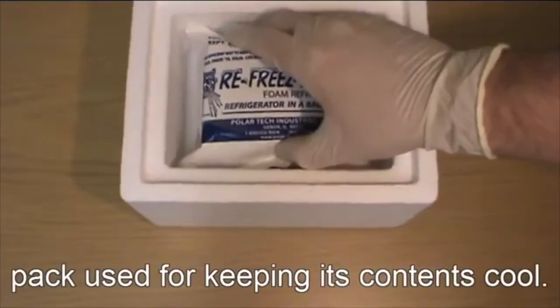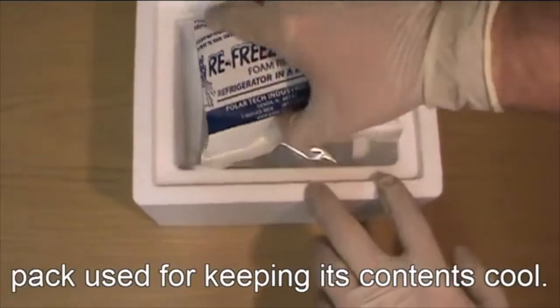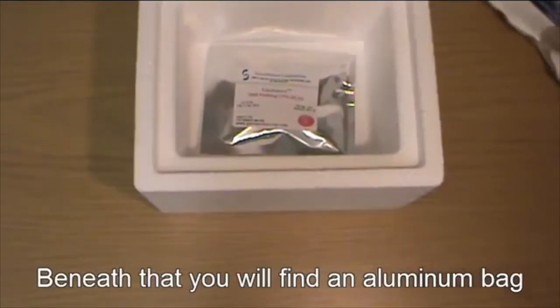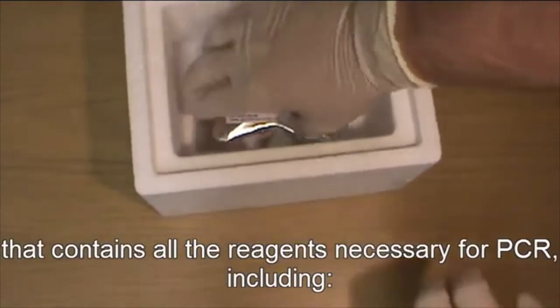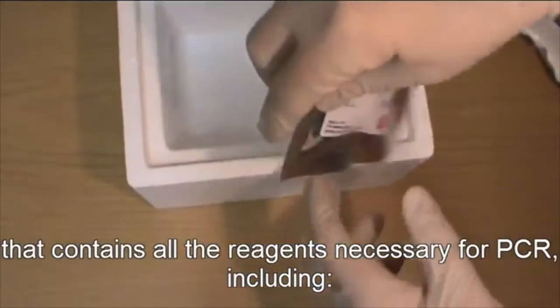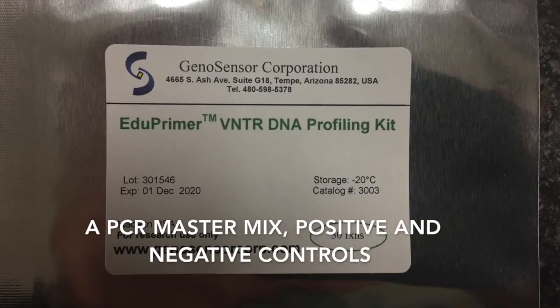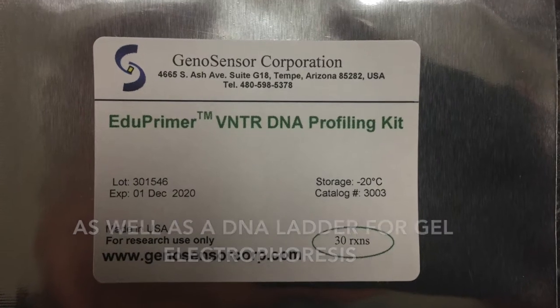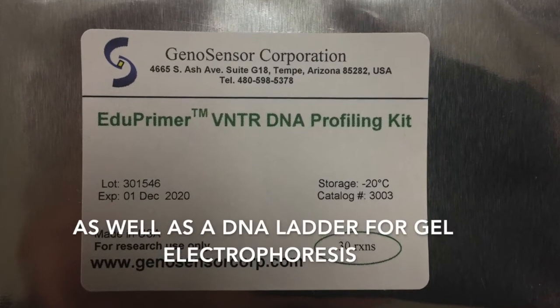Inside the icebox, you will find an ice pack used for keeping its contents cool. Beneath that, you will find an aluminum bag that contains the reagents necessary for PCR, including a PCR master mix, positive and negative controls, as well as a DNA ladder for gel electrophoresis.